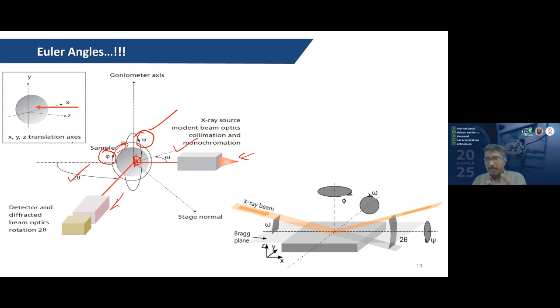This happens especially when we deposit a thin film on a single crystalline substrate. The peak from the single crystalline substrate will be very large, so we'll miss out minute features of our film. So in case of normal XRD, the major contribution is from the diffraction from the substrate itself. So up to some extent, we can say that the XRD technique is not surface sensitive. And GID, or glancing incidence XRD, is designed to overcome this difficulty.